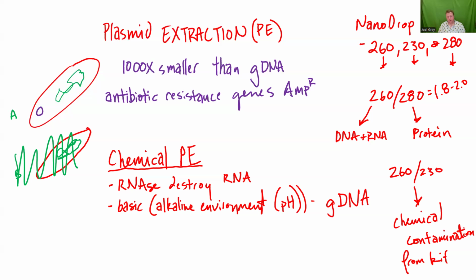And so, it looked like everyone did a really good job from what I saw, and so keep it up. The last thing about this was those calculations on page number 23, and it seemed like everyone got through those calculations without too much of an issue. I think in large part that's because most people's concentrations of DNA were about 120 to 280 nanograms per microliter. That was the range that I saw. There were some that were considerably lower and some that were considerably higher, but those are good numbers.